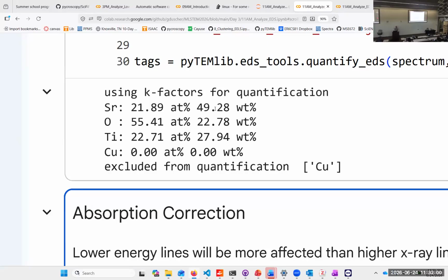So it is the low-lying edges with the photons that have low energy. If you want to get them out of your sample, you have absorption. And the same way, I did actually cheat a little bit.